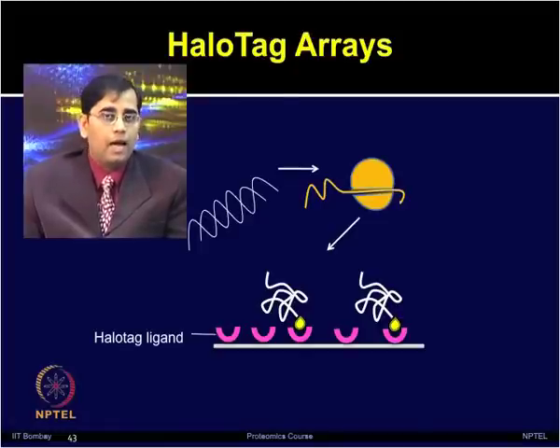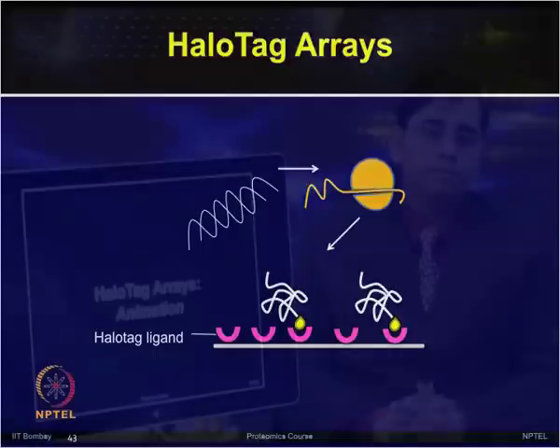by using HaloTag system. So, in HaloTag arrays, the capture chemistry, which is based on binding of HaloTag protein with synthetic ligand, enables covalent and oriented capture of proteins on solid surface directly from the cell-free expression based system.